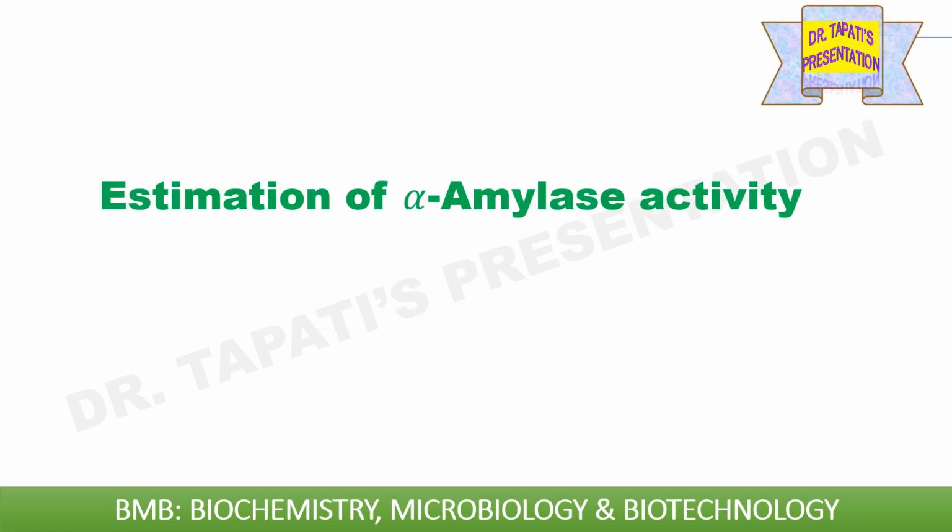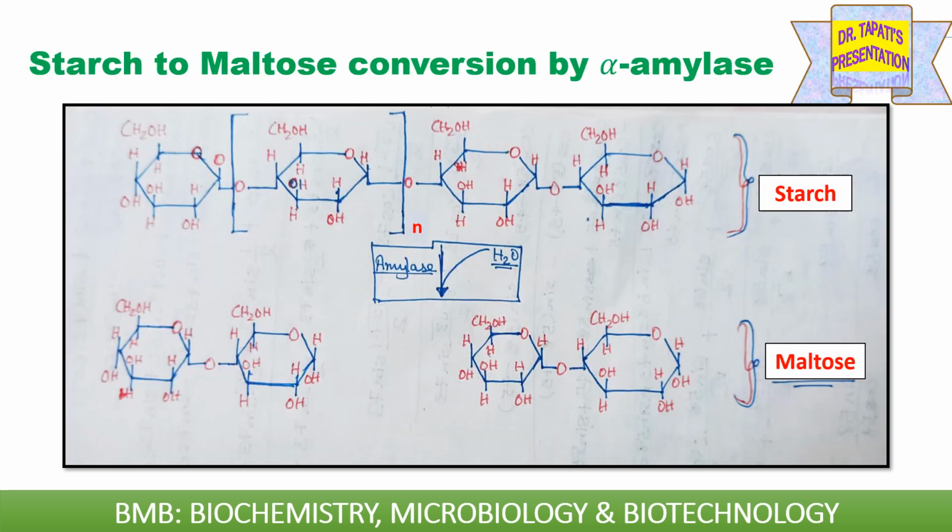Let's do the estimation of alpha-amylase activity. In the alpha-amylase assay, starch is the substrate and maltose is the product.